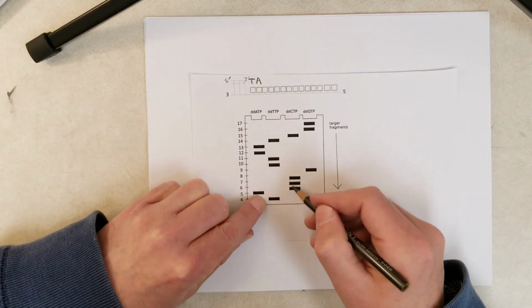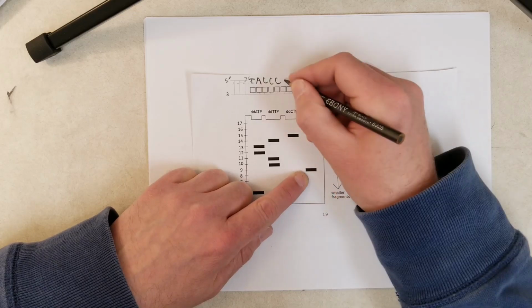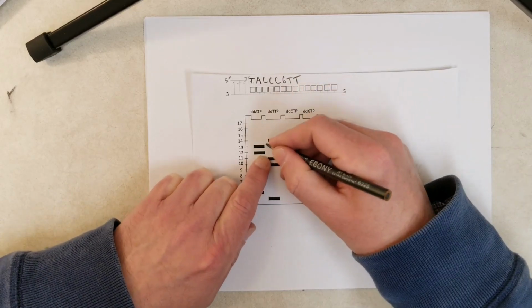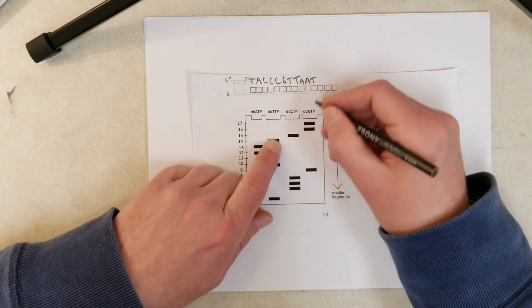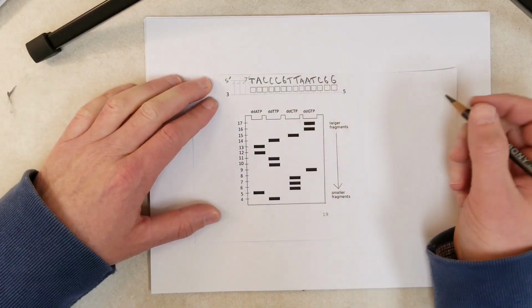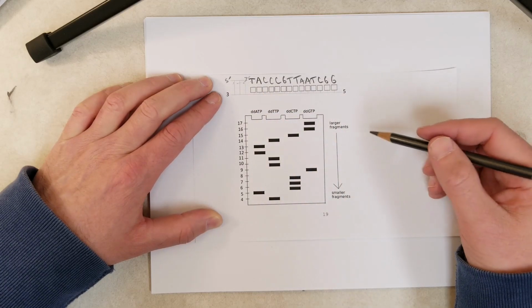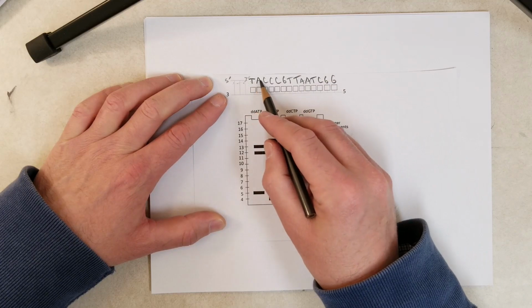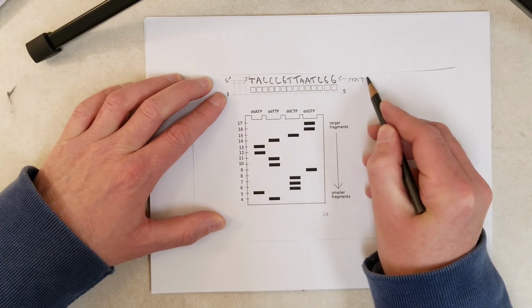Okay, so we're just reading up. CCC, G, TT. So this is really easy, right? You probably don't even need to understand genetics. There's probably only really one way to put this data in that makes sense with this diagram. So maybe I won't give you a diagram like this on the exam or the quiz. Okay, so now we have the sequence of the non-template strand.